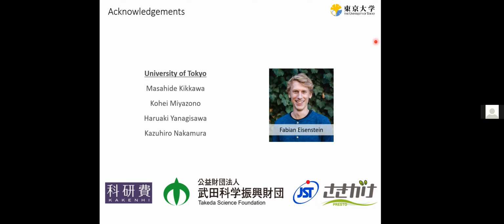Yeah. So we have a quick question from Hongyi, and then I might go to Isabel. Hongyi Shu says it's midnight where he's coming from. So he would like to know about how much benefit CS or even CC correctors will bring to cryo-EM, if you had any thoughts on that.